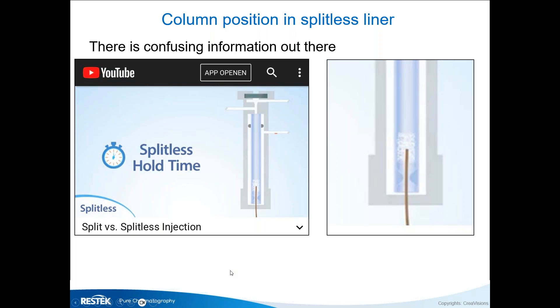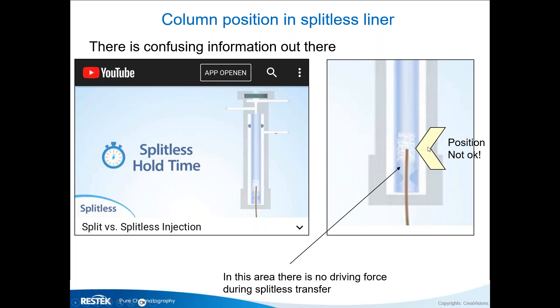There is some confusing information out there — I found a YouTube video giving incorrect information about splitless injection. The pictures shown indicated a column position that is absolutely not okay for splitless. In splitless injection, you only have carrier gas driving the analytes into the column. Below the column inlet there's no driving force, so you can never get reproducibility. The column should always be positioned at the bottom of the liner for splitless injection.